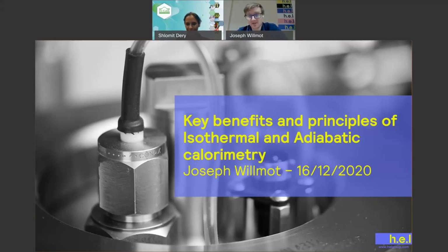So yes, good afternoon. I hope you have all been enjoying the previous presentations that have been happening throughout the week. I found them quite enjoyable. So the final webinar that we'll be going over today, we'll be discussing the key benefits and principles of isothermal and adiabatic calorimetry, and essentially how they will help aid in the design of better batteries and better cells.